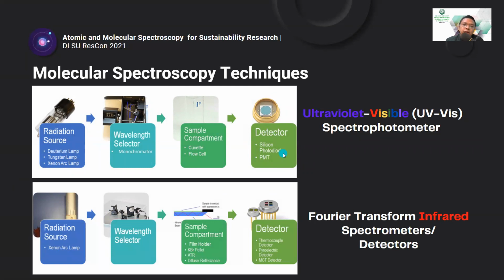And then lastly, i-receive siya ng detector. It could be a photomultiplier tube. So it's a common theme for spectrophotometers, yung PMT. Sensitive kasi siya. It could also be other detectors like InGaAs or lead sulfide for those which will be going pa towards the NIR detection.